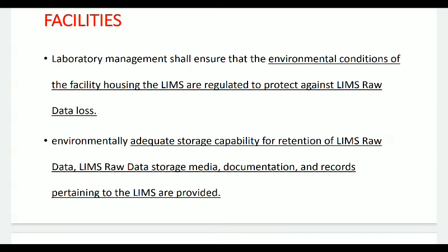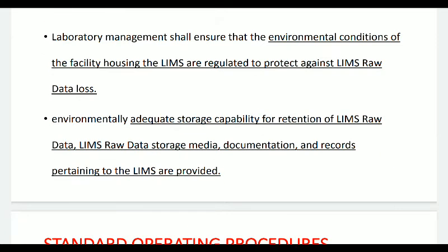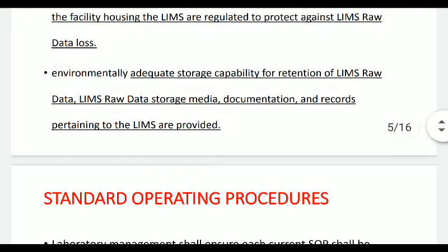So in order to avoid loss of LIMS raw data, we must ensure that the facilities are suitable for the optimum operation of software as well as hardware, and it is the job of laboratory management to ensure such a facility where the LIMS is being operated.